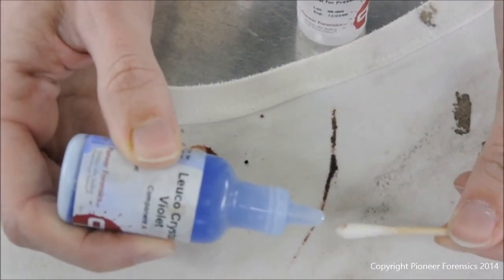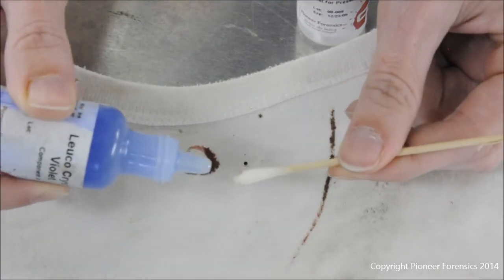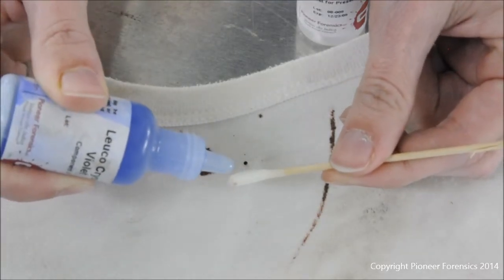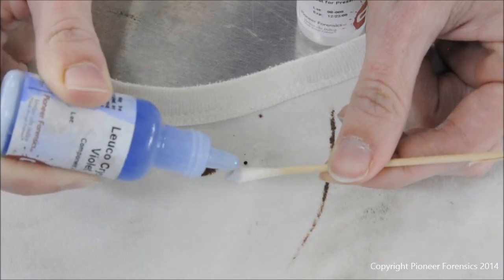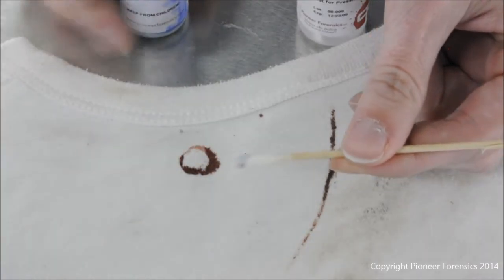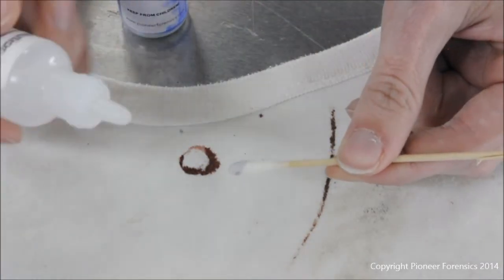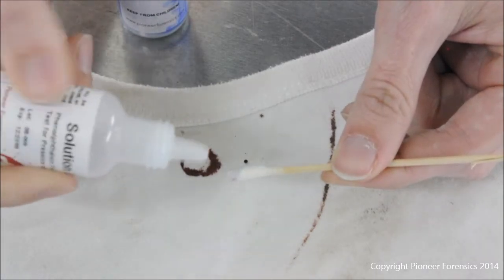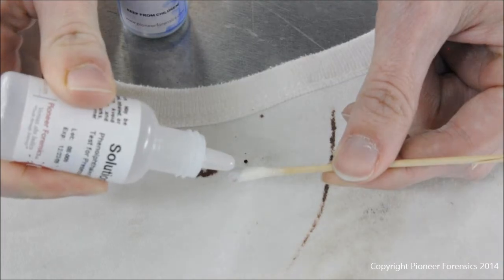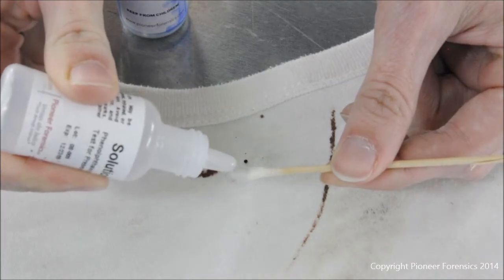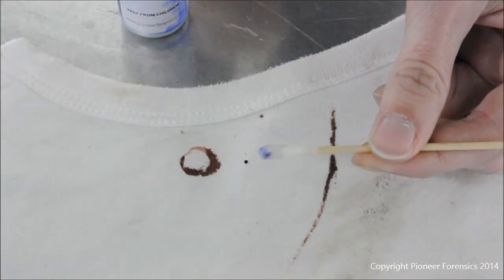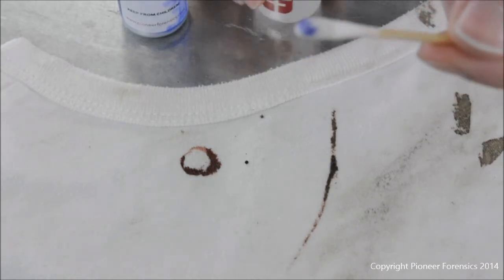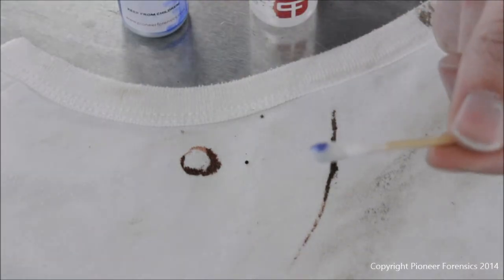Blood will take on many different looks, and when you're making some type of analysis of your crime scene, it's good to know whether what you are looking at is actually blood or if it's another substance. Applying Leukocrystal Violet to the suspected material, similar to a phenol thaline test, having an immediate result is a very reassuring presumptive positive.